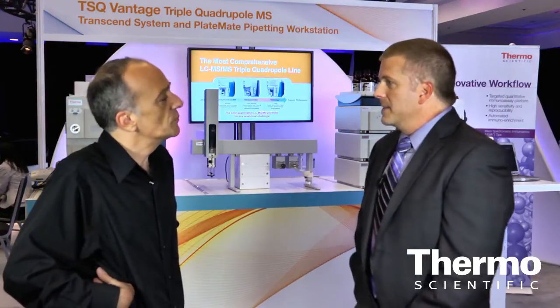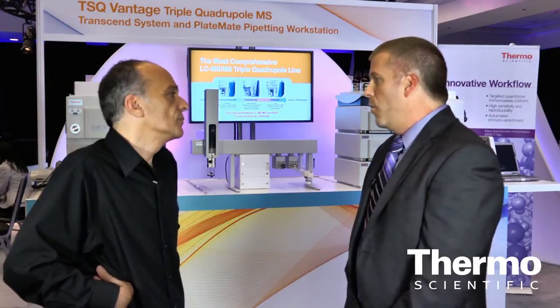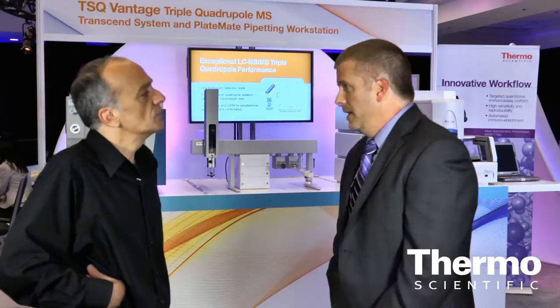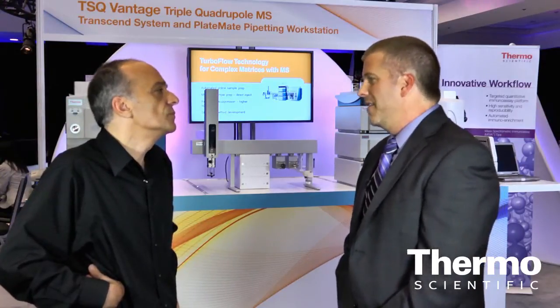The Quantum Access Max, for an entry level triple quad, has the best isolation window of 0.4 AMU for the entry level performance mass spectrometer. That helps the user remove matrix ions away from their ions of interest. It also has a very large mass range — from 10 AMU all the way up to 3000 — and polarity switching of less than 25 milliseconds. It has the most complete performance for the price.